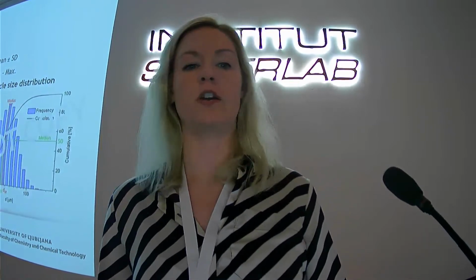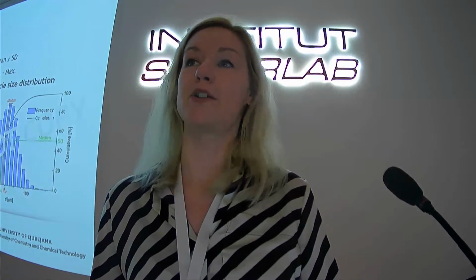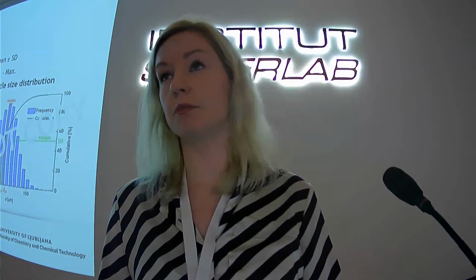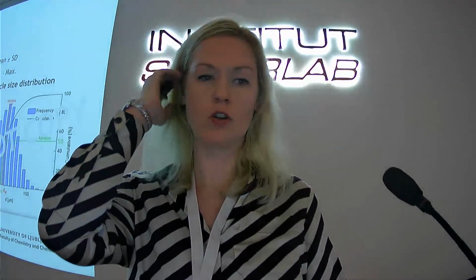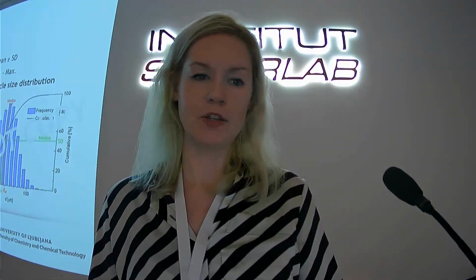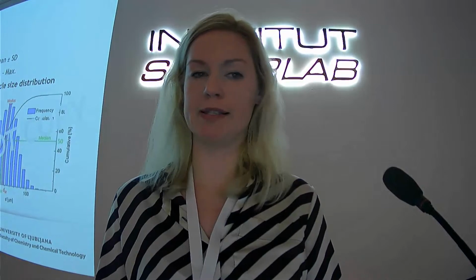Of course, an optical stereo microscope or also a scanning electron microscope can be useful, but they are very time consuming because you need to measure at least, I would say, 100 particles to get at least a little bit reliable data on the size of the microplastics. Of course, DLS, maybe not mentioned here, is also quite commonly used, and one possibility is also laser diffraction analyzers. This is something that I will also present to you afterwards, because this is one technique that we are usually using. So how can you then determine the size?